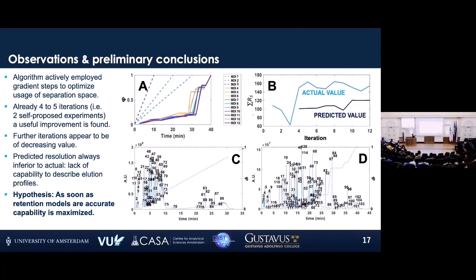So here you see the score again, right? So the score, this is a different score yet again. It goes up, which is really nice, right? So fortunately the scans were not that good as the end result. But you also see after that nothing is happening anymore. And this is completely in line with what we would expect from a retention model, because the retention model, right, the idea is that if you know the actual model, then of course you can add more data as much as you want, but you already know the key model. So you should already be able to predict this, unlike machine learning, which I will get back to.